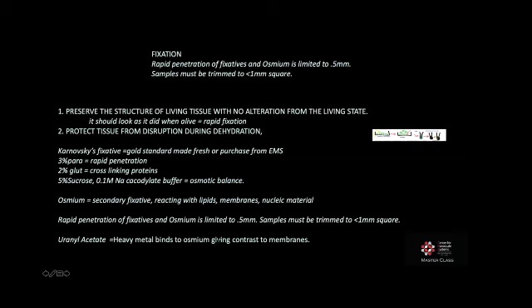It's also important that you trim your samples to not greater than 1 millimeter square, because osmium and the glutaraldehyde are not going to penetrate any deeper than that within your sample. So you want to trim them small so that you get good rapid penetration of your stains through to the center of your sample. We follow that up with uranyl acetate, which is a heavy metal that binds to the osmium, and again gives contrast to the membranes. Typically, I use uranyl acetate overnight and begin my dehydrations the next day.